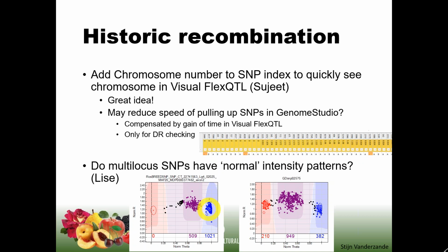But individuals that are AA for the first locus and BB for the second locus will now have a mixture of A's and B's, because that second locus also amplifies, which makes the A cluster move closer towards the B position, and the same is true for the AB. So a multi-locus SNP can have your cluster squeezed if only a few individuals segregate for the second locus.